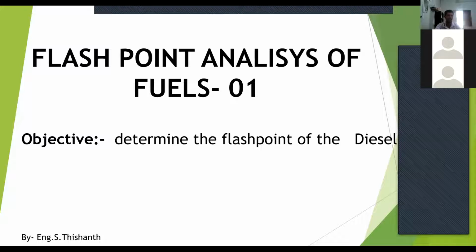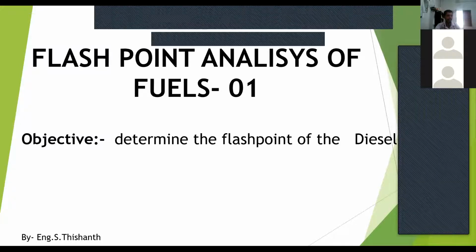One of the reasons to find out the flashpoint is safety, right? If you don't know the flashpoint and we are using that fuel, we are taking a risk.